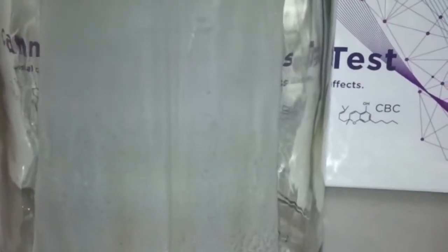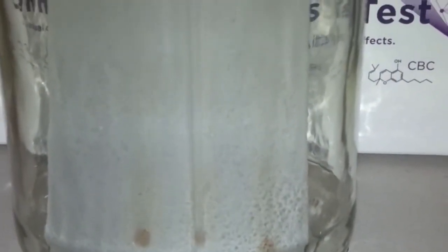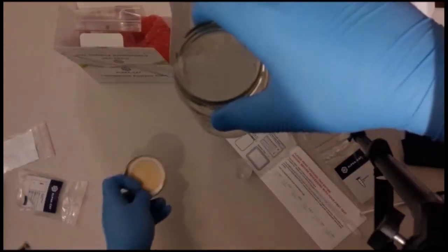Once 25 minutes has passed, you will see that the test plate has soaked up all the solution. The sample has travelled up the plate with the test fluid, so we know that the process has worked well so far. Now, we carefully take out the test plate and leave it to dry for around 5 to 8 minutes.